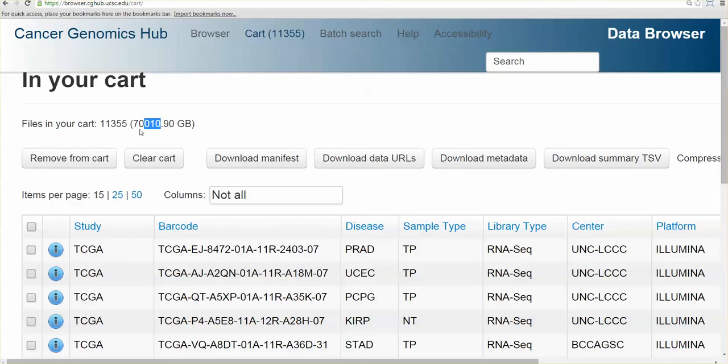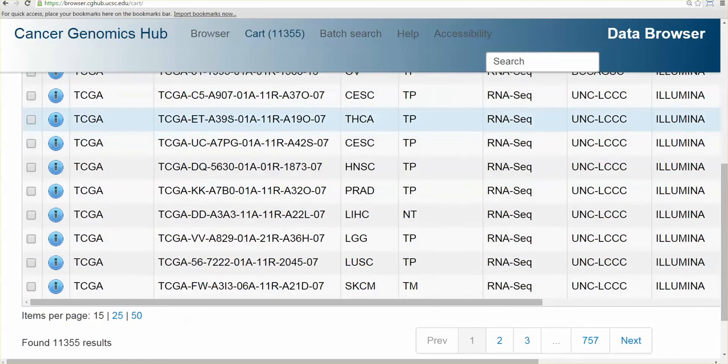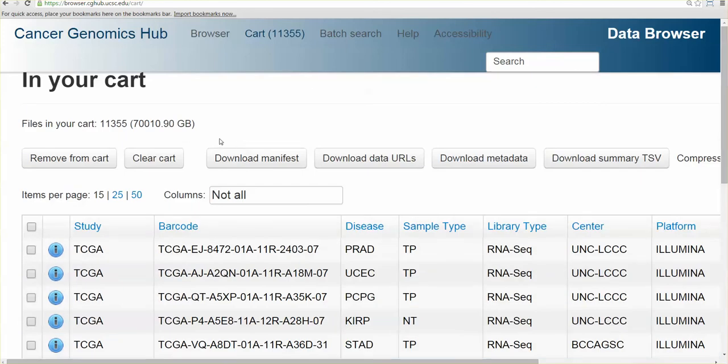And this is compressed data, so when you uncompress it, it could easily be over 200 terabytes of data. And, you know, at OmnisRes, we could theoretically, if we wanted to, download all the data, but I'm not sure how much the server space and such would cost. I'm not sure it's worth it.